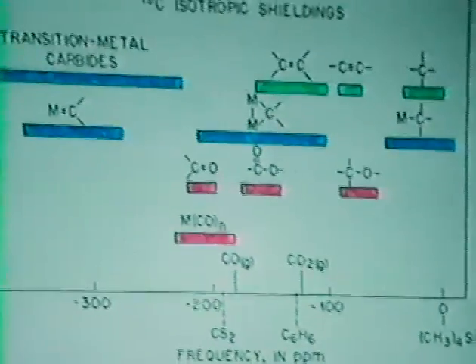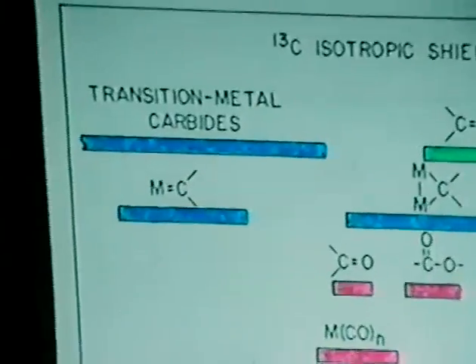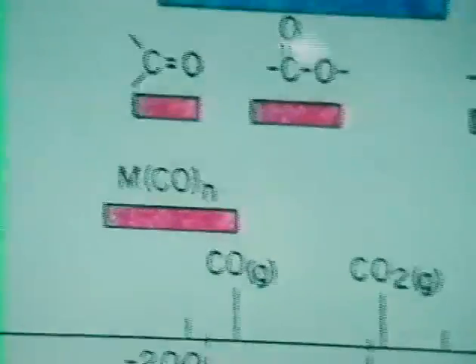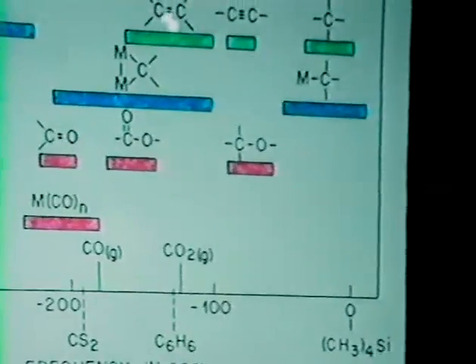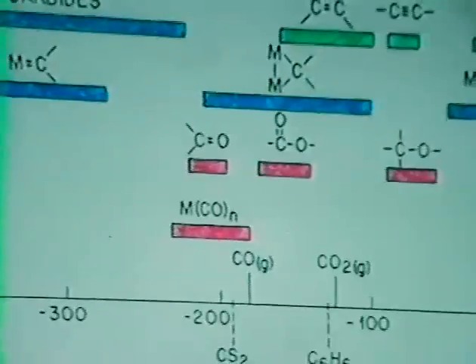Now, I've diagrammed the different bands you'd expect to see for different molecules or species in Fischer-Tropsch synthesis. We have the oxygenated species here in red, CO, or other types of acids, oxy groups here. We now have those that are just totally hydrocarbons, double bonded, triple bonded, and single bonds. And we also have those that are somehow involved with the metal, here, here, here, and the traditional carbides. I'll come back to this later when we want to analyze the different species that are there.